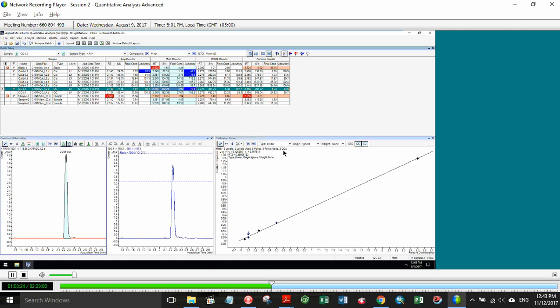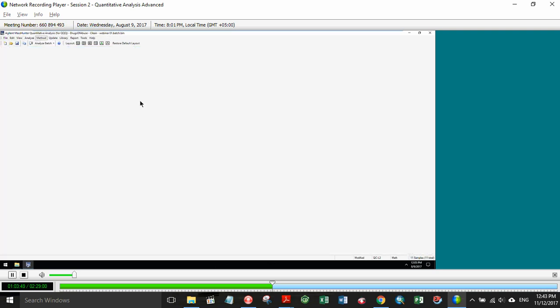Okay, great. And the default noise is Y. Is the default noise set at X5 times 5, I assume? What that is is just a default value. What we have is a multiplier. If we go into Method Edit and we bring up the signal to noise, advanced tasks, noise.